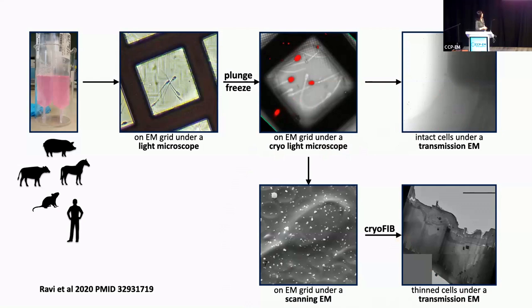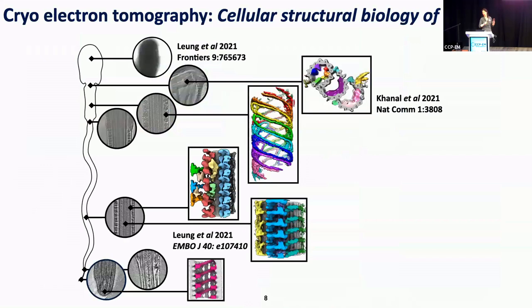From the beginning, we took a holistic approach where we analyzed, from head to tail, the whole cell, because that is one of the powers of electron tomography: once you have your sample in the microscope, you should look everywhere.